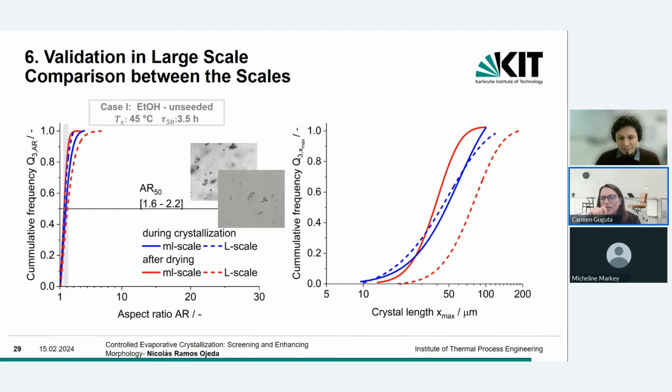But the measurement with the crystalline, of course, you can do it on the pictures, but I think for the crystalline version 1 that I saw in your picture, I'm not very sure if you have taken the data and calculated separately, right? Yeah. We need to develop or write a separate script.